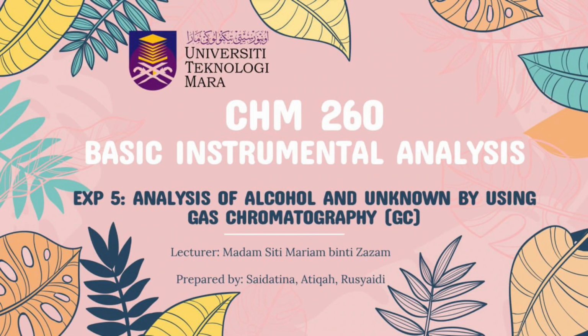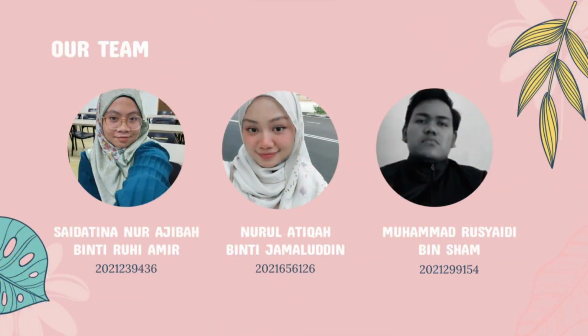Assalamualaikum. Hi, in this video we are going to present and explain about experiment analysis of alcohol and unknown by using gas chromatography.